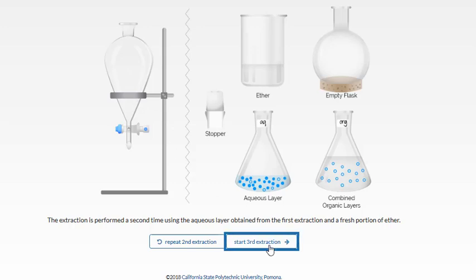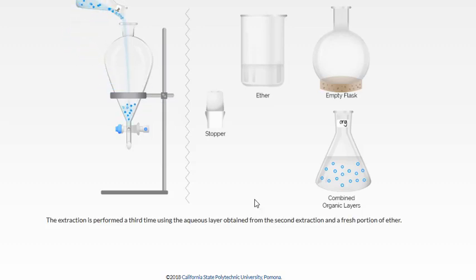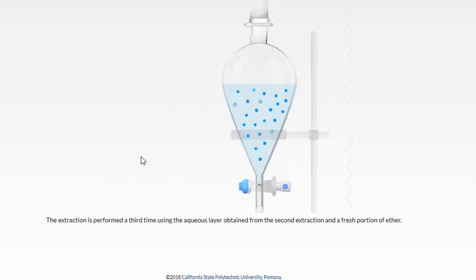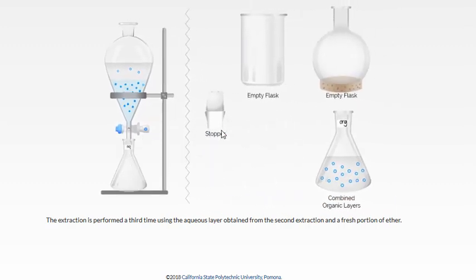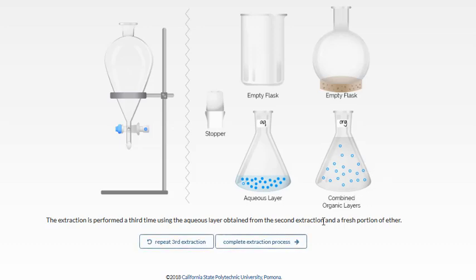Once the two layers have clearly separated, separate them into two different flasks. For the final third extraction, pour the aqueous layer back in with another fresh portion of ether to get the last bit of desired compound into the organic layer. Mix to achieve equilibrium, then drain the aqueous layer and add the organic to the same flask. We describe this as our combined organic layers, so all organic extracts go into the same flask.